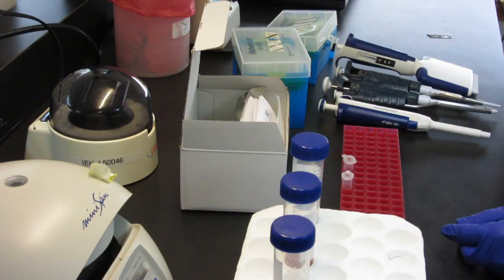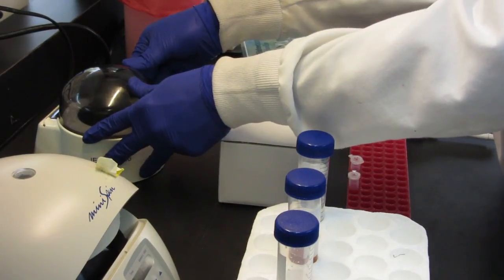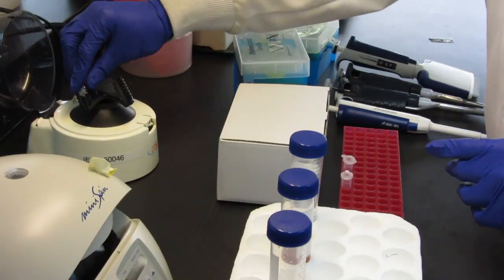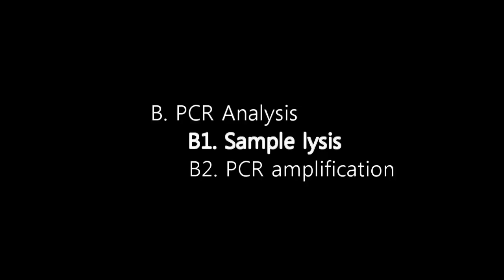You will then want to vortex briefly, pulse centrifuge your sample tubes, and then proceed to the PCR analysis step. The PCR analysis step consists of two parts. There is sample lysis and PCR amplification.